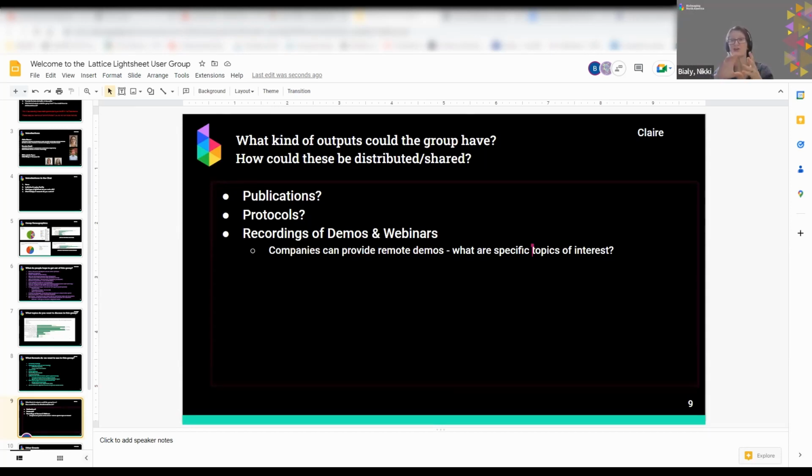Latin America Bioimaging, Africa Bioimaging, Canada Bioimaging, German Bioimaging. You can put jobs up there as well. So it's trying to collect all of the resources that are of interest to people around any of these microscopy related topics into a centralized data repository. And you can access it from any of the BINA pages, or you can Google Microscopy DB.